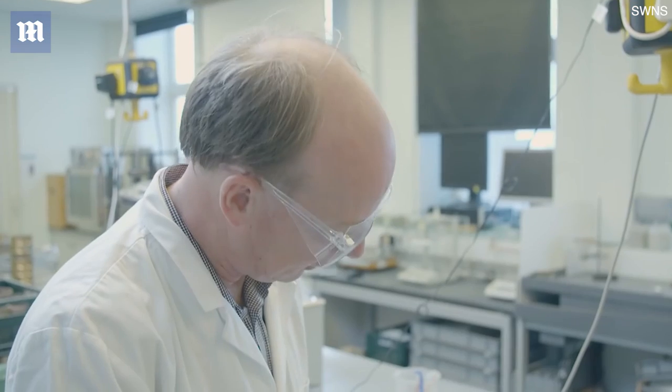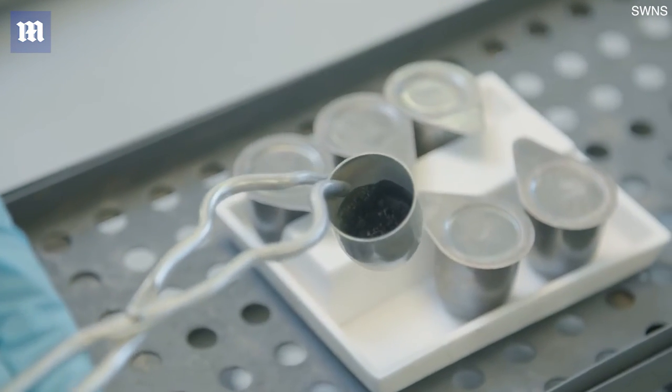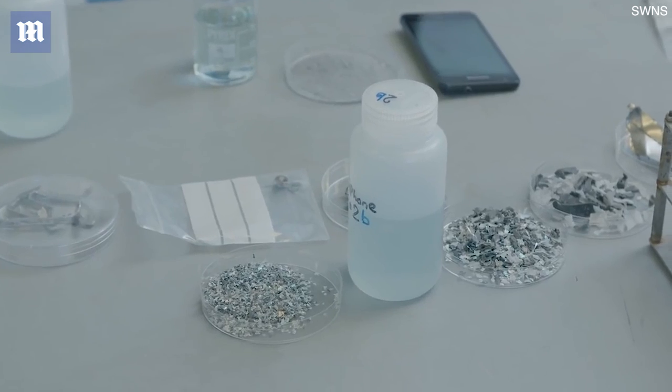I think that looks good. It's nice and black and dark and sort of a bit molten. But what's great about this stuff now is that we can take this to the lab and dissolve this very easily in some weak acids.